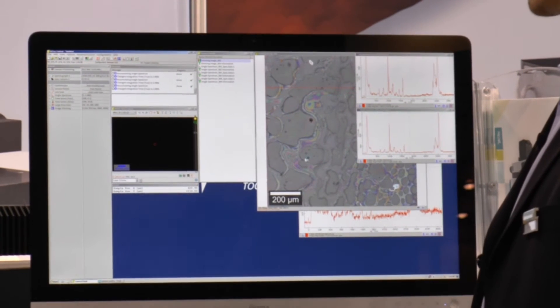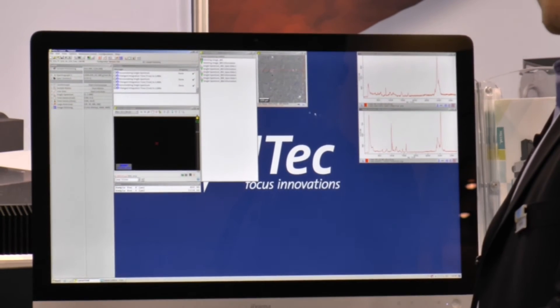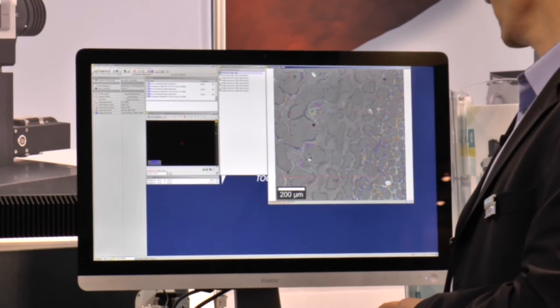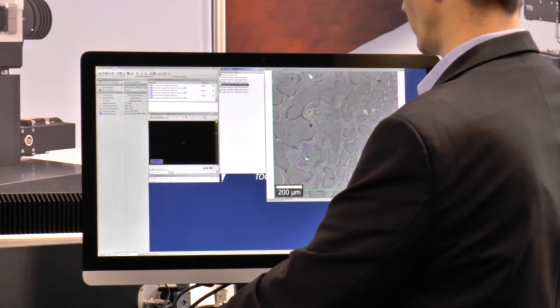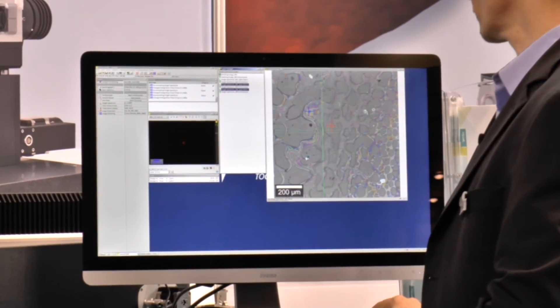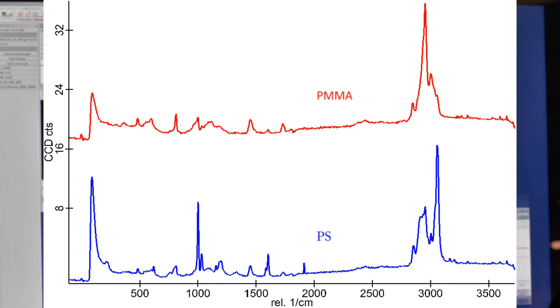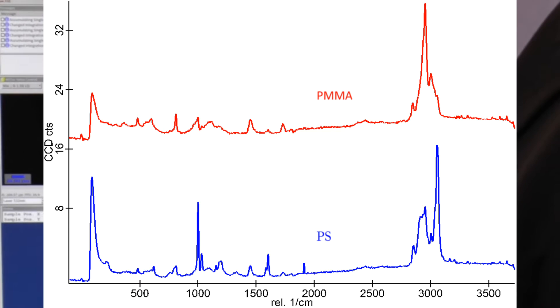Now if we sort the screen for more clarity, closing these images and zooming in, I can locate where my spectra were recorded by simply dragging and dropping them onto the screen. One spectrum was recorded here, one was here. Hitting enter displays those two spectra, so I can analyze exactly what is at which position with a very high level of confocality.